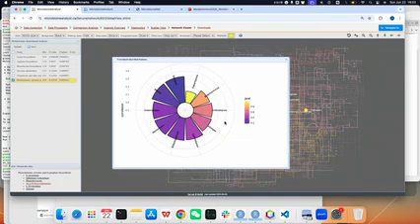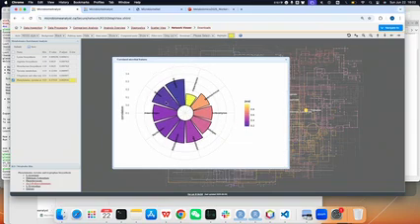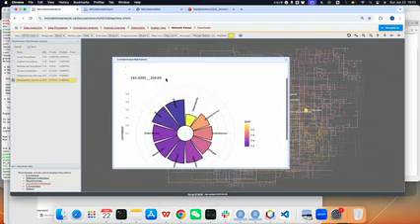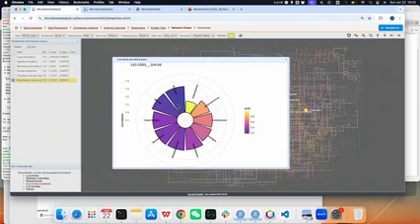It highlights those features, species that are most correlated to the peak, which means the origin of this peak's potential metabolites may be produced by the most correlated microbes. But this is the statistical version.